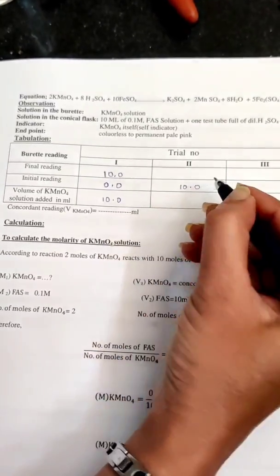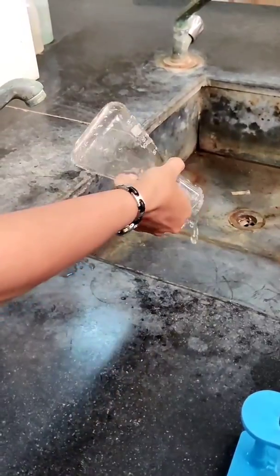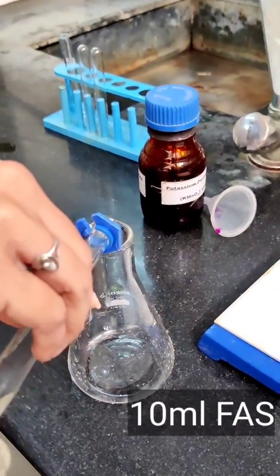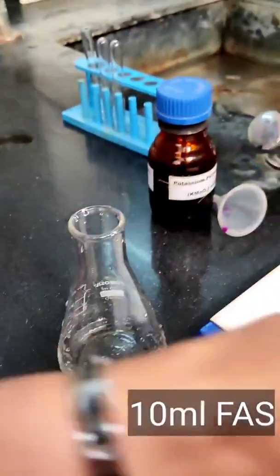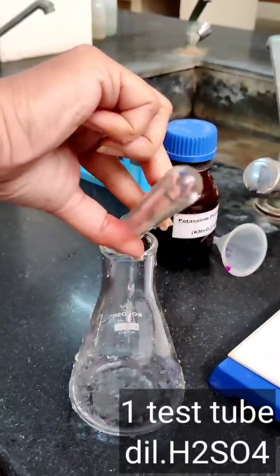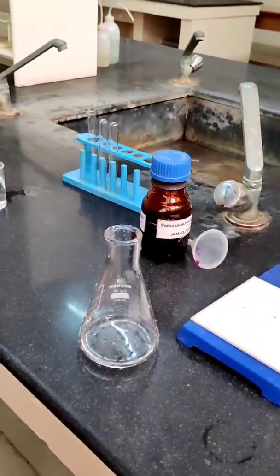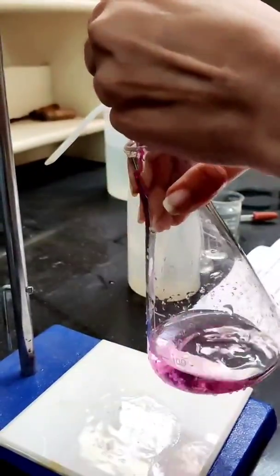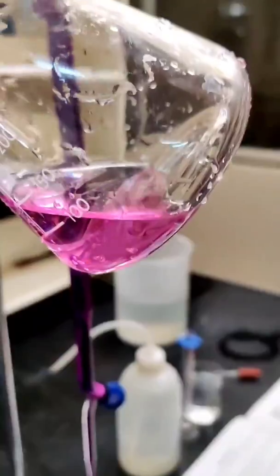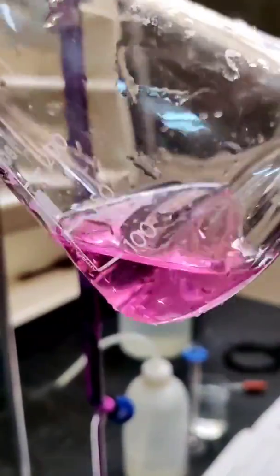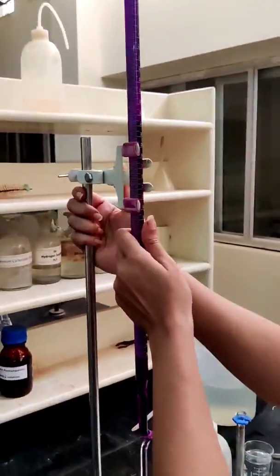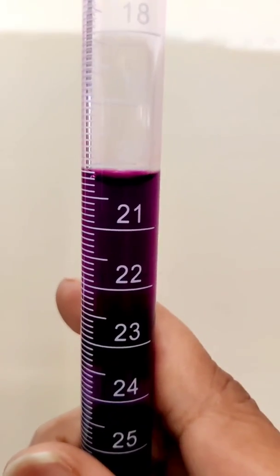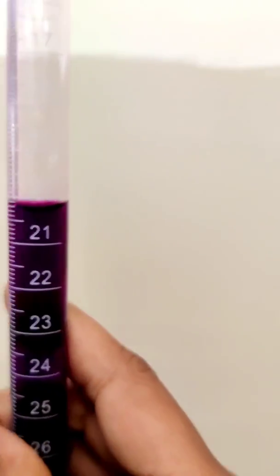Repeat the titration to get concordant values. Wash the conical flask thoroughly. Repeat the titration. This is my second reading of the trial. Note down the reading.